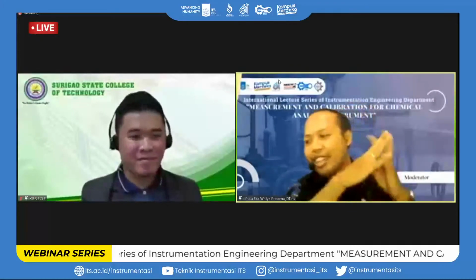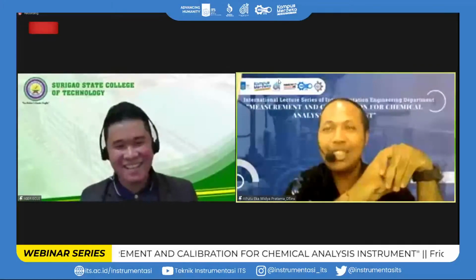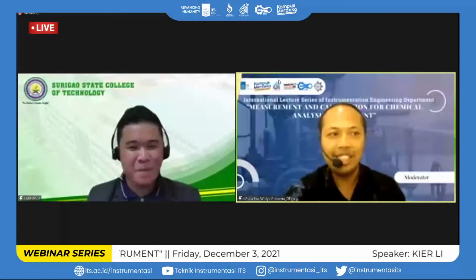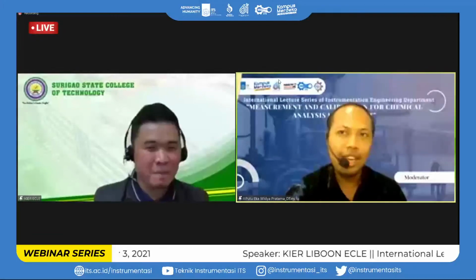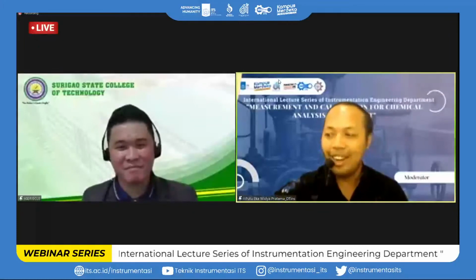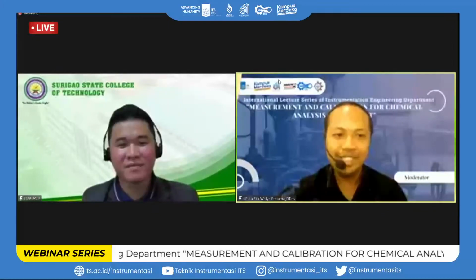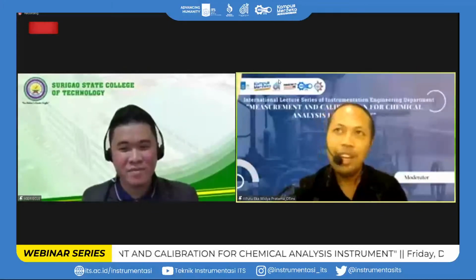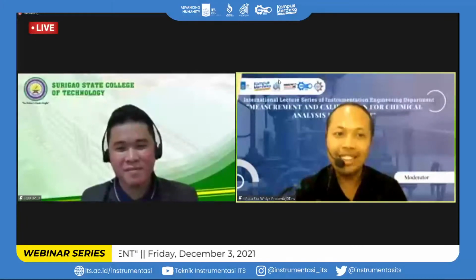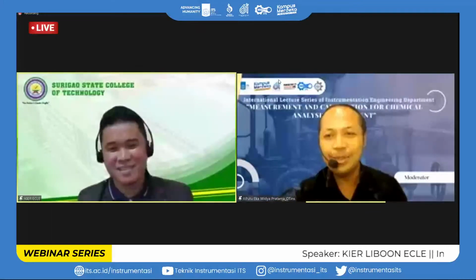Okay, sir, I have one question. Since this is about spectroscopy, we have so many projects in industry, especially in water treatment. You already explained how to detect mercury in water treatment. So we have a project like COD and BOD, chemical oxygen demand or biological oxygen demand. How to analyze this using UV-visible?